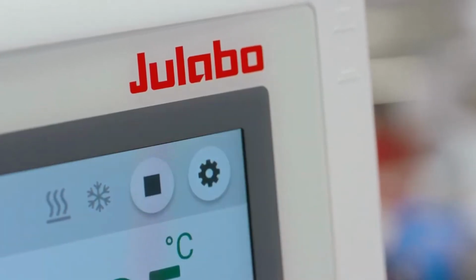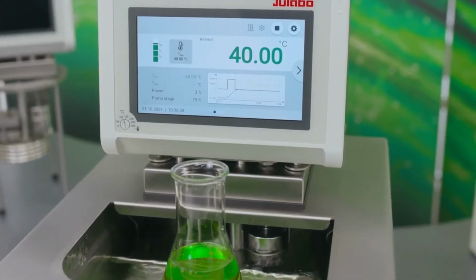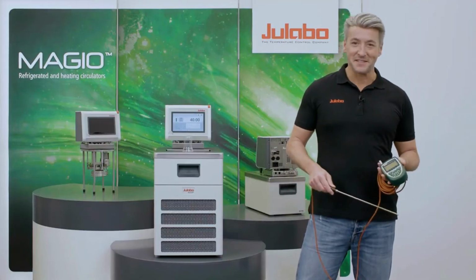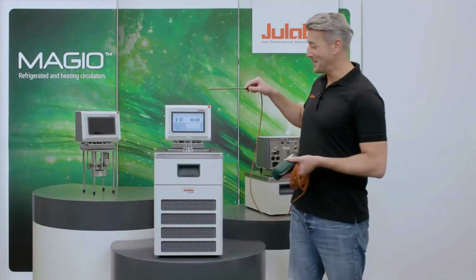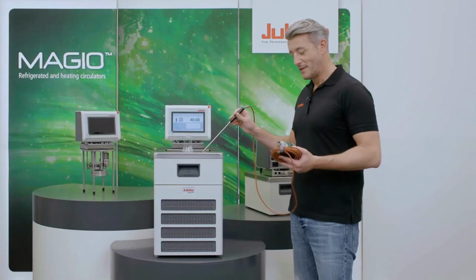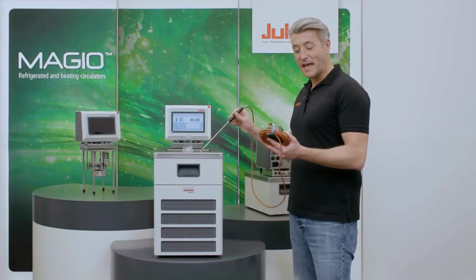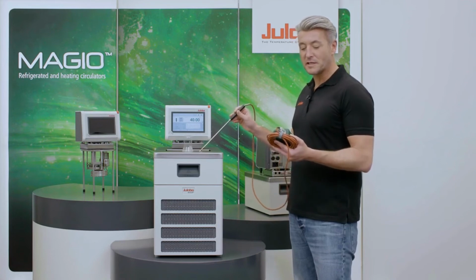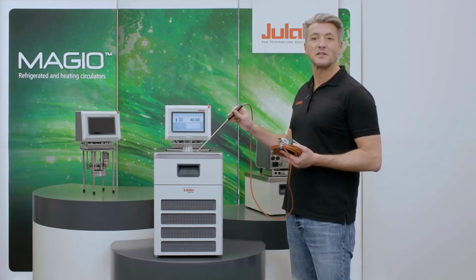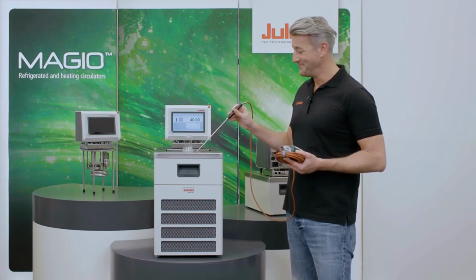The Magio is heated to 40 degrees Celsius and a sample is placed into the bath. Now we need an external temperature sensor to check the defined point inside the bath. For an accurate reference, please wait a few seconds. The temperature sensor now shows us a temperature of 40.02 degrees Celsius, so we need to compensate the difference of 0.02 degrees Celsius.